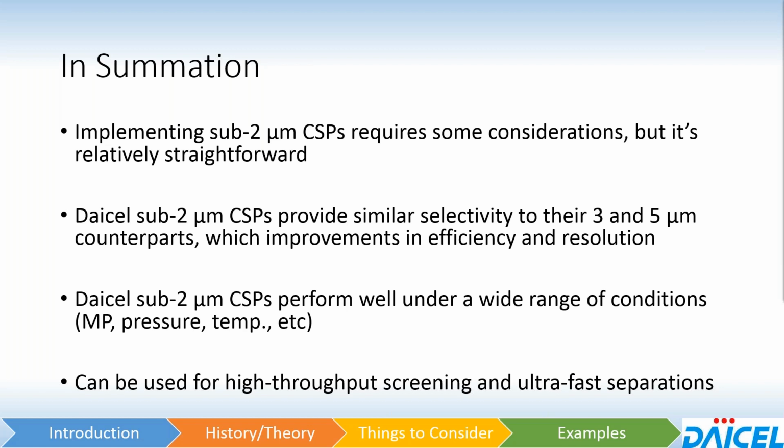And at the last couple of slides there, pointed out that they can be used rather easily for high throughput screening and ultra fast separations.